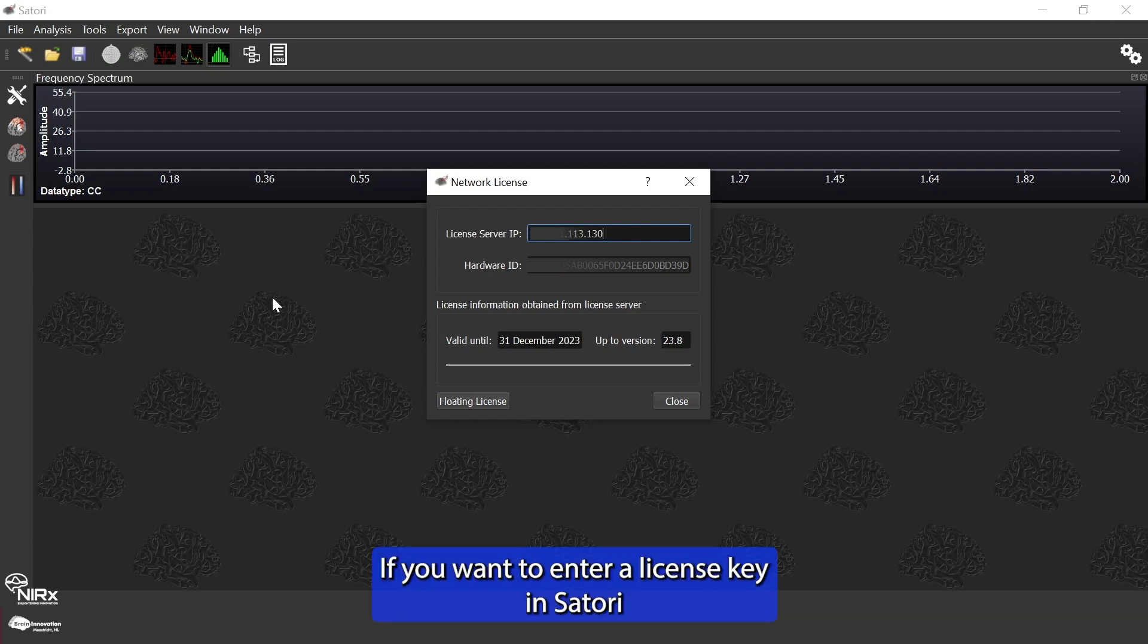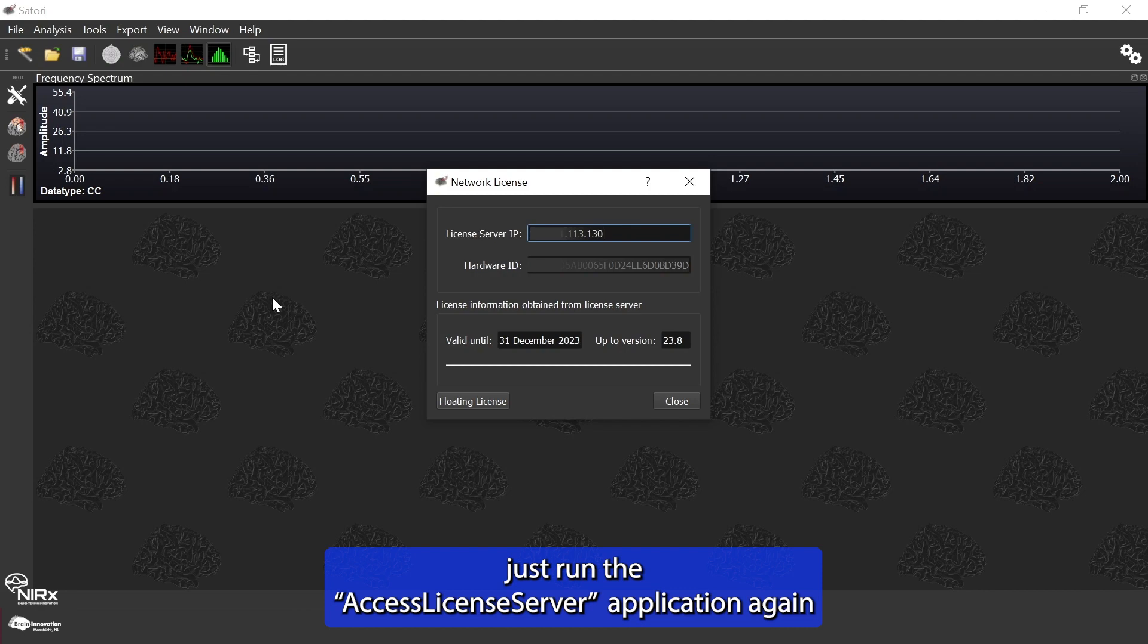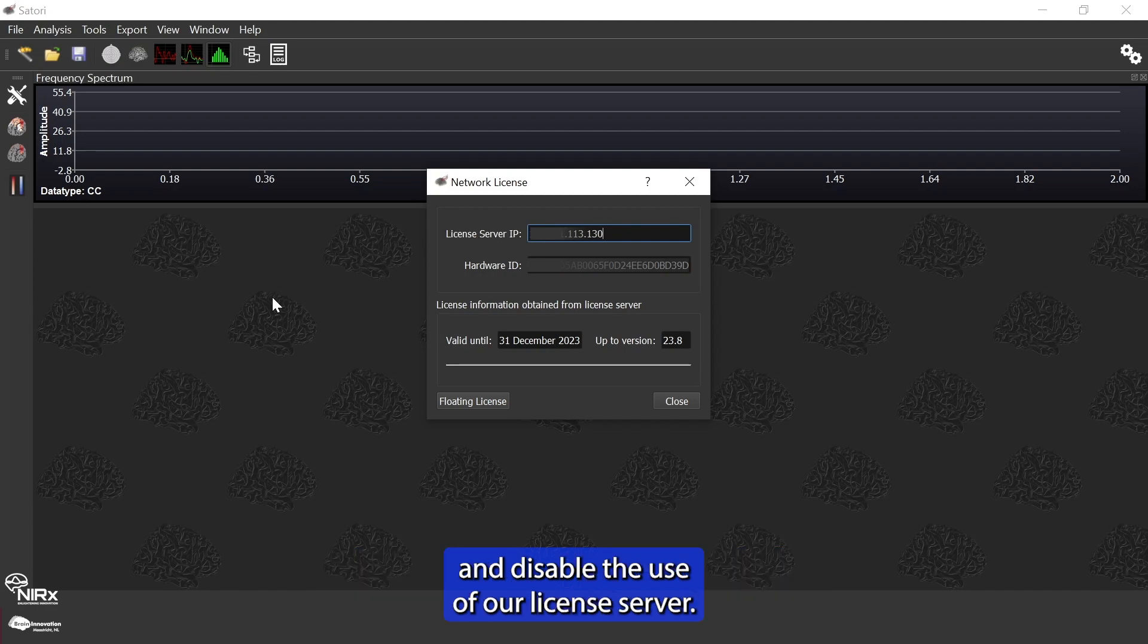If you want to enter a license key in Satori when you have already used the license server or floating license before, just run the access license server application again in your Satori installation folder directory, which is in your home/user folder, and disable the use of our license server.